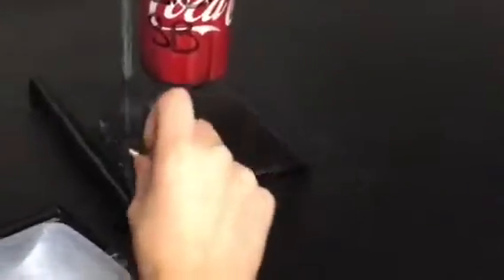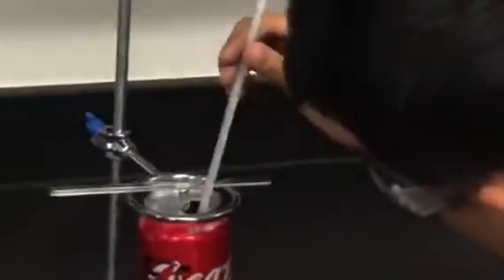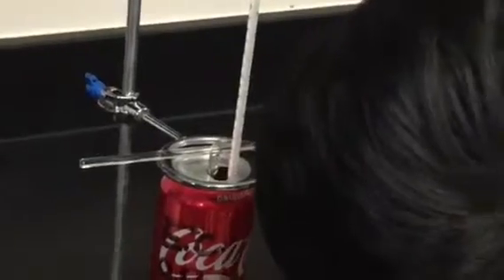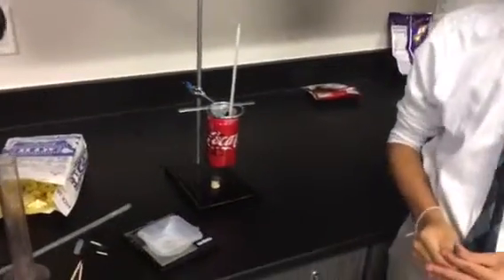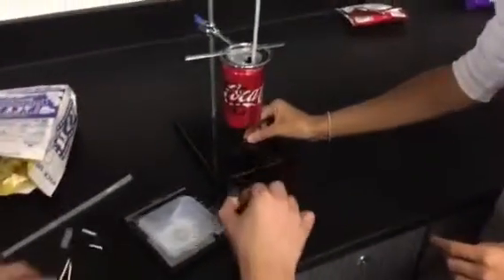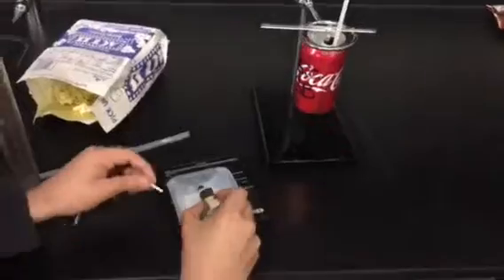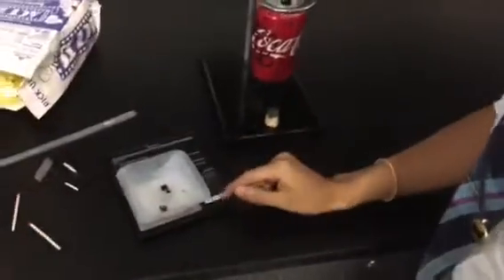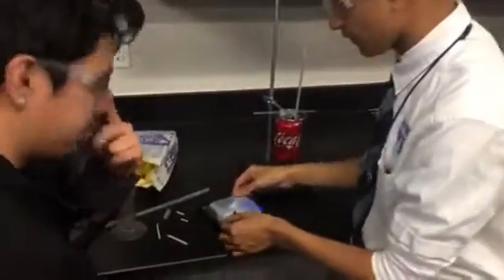Okay, now what's the temperature of the water now? You can also measure the temperature. 32 degrees Celsius. Okay, now measure the mass of the popcorn, whatever's left. Why would you touch it? It's hot. You could have gotten it up. Measure it, and then add it to the soda can. Nothing? So 0 again then? Yeah. Okay.